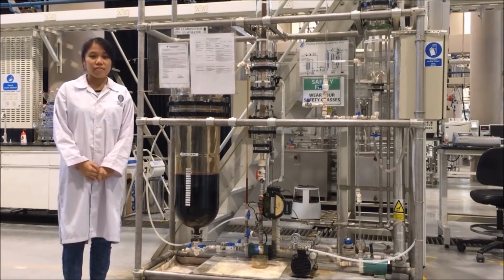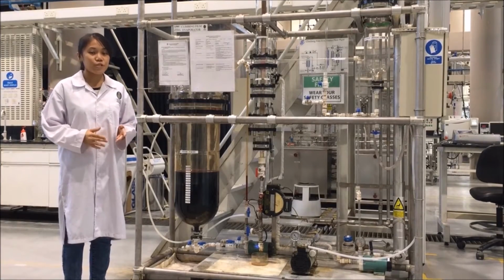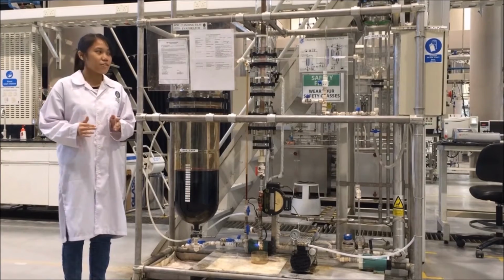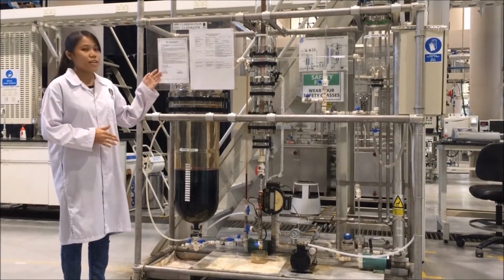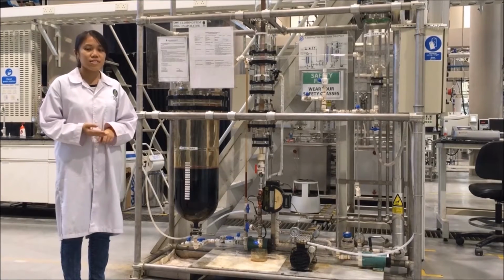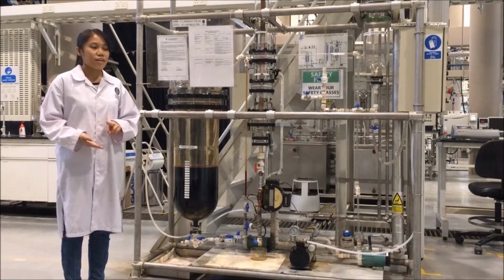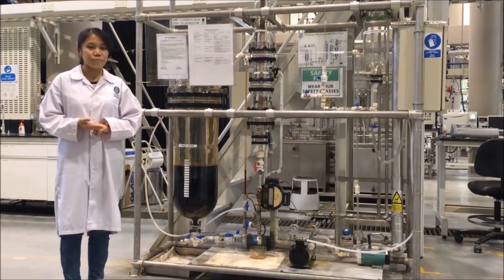In experiment 1, our objective is to find the effect of evaporation pressure on evaporation rate. As a reminder, in this experiment we set the feed level at 25 cm and we vary the pressure from atmospheric pressure, which is 760 mmHg, to negative 200 mmHg, negative 400 mmHg, and negative 600 mmHg.